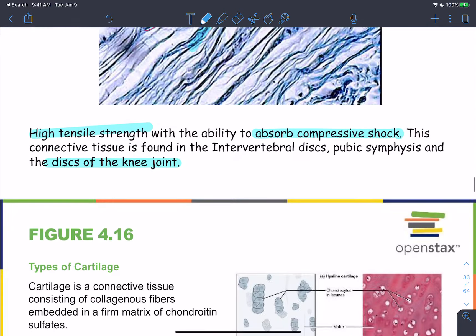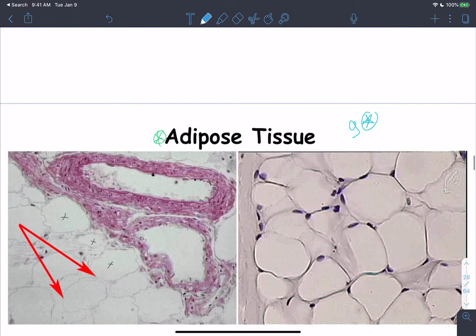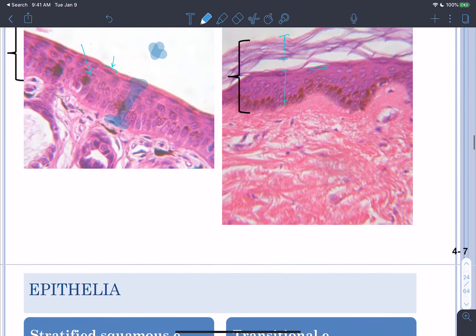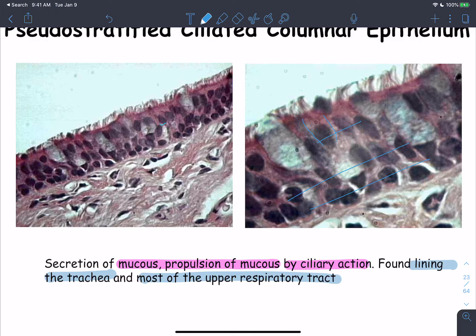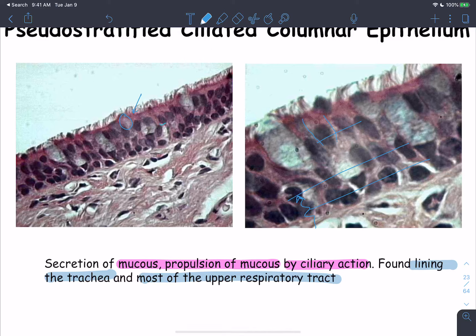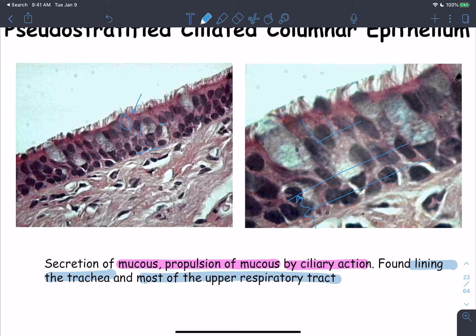This is because the epithelium is avascular. To get nutrients and oxygen, fluid must travel up to the basal cells first, then all the way to the apical cells. The apical cells receive the least amount of fluid containing oxygen and nutrients, so it's not logical to have large columnar cells at the apex in a stratified epithelium. In fact, all the cells are attached to the basement membrane — meaning there is only one cell layer, but the crowding gives a false impression of stratification.